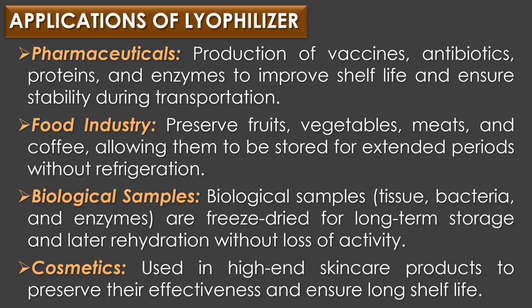Applications of Lyophilizer. In pharmaceuticals, lyophilization is commonly used in the production of vaccines, antibiotics, proteins, and enzymes to improve their shelf life and ensure stability during transportation. In food industry, freeze drying or lyophilization is used to preserve fruits, vegetables, meats, and coffee, allowing them to be stored for extended periods without refrigeration.